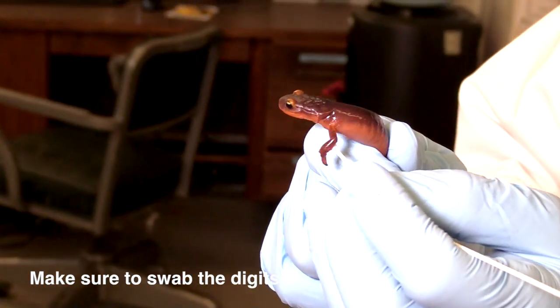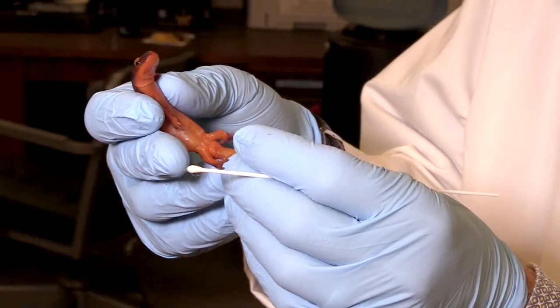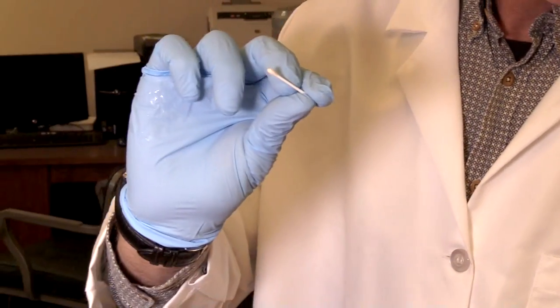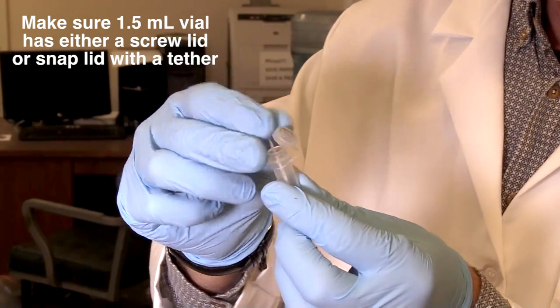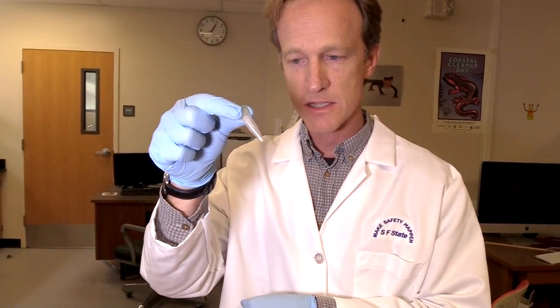It's a little hard to do. Now I can put this little guy back down and break off the little swab and put it in its vial. This is what we will later extract DNA from and run the quantitative PCR to see if it's infected with the particular pathogen that we're studying.